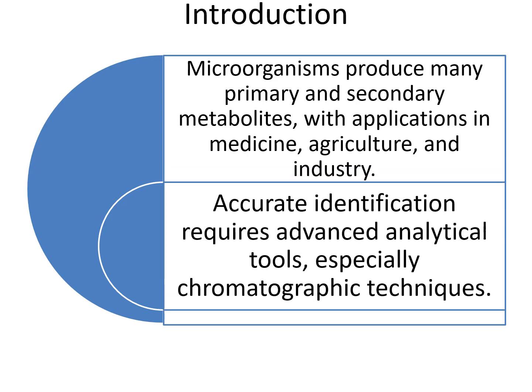Now, accurate analysis and identification of these metabolites requires advanced analytical tools, especially chromatographic techniques, which is the focus of this presentation.